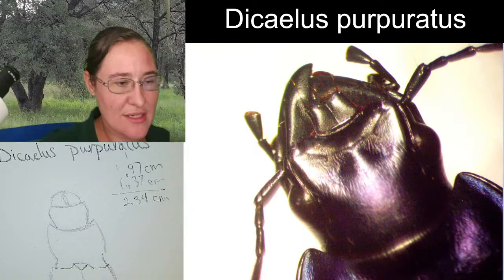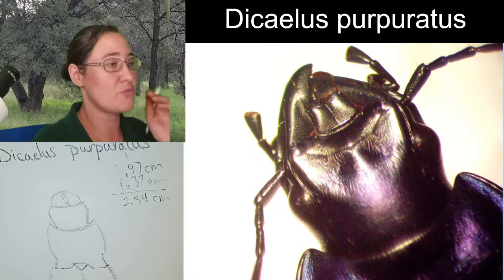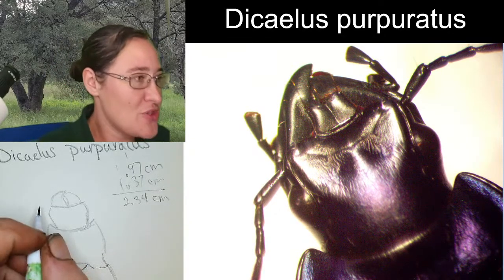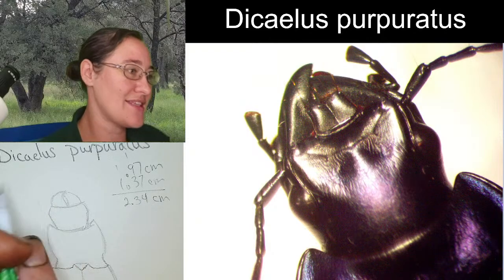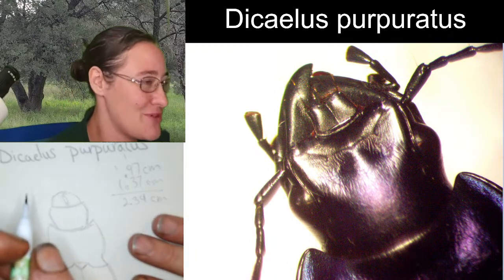And Deb, if you have any questions, just go ahead and let me know. They are predatory. I think I collected this one at a black light. I think it came into the light, and I was really excited because it was so beautiful and metallic.